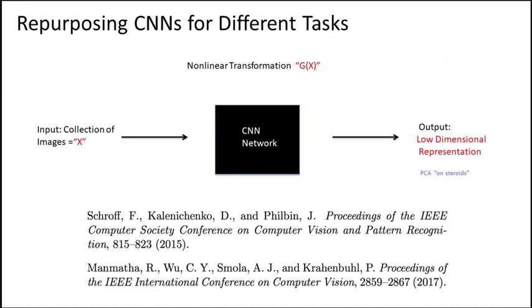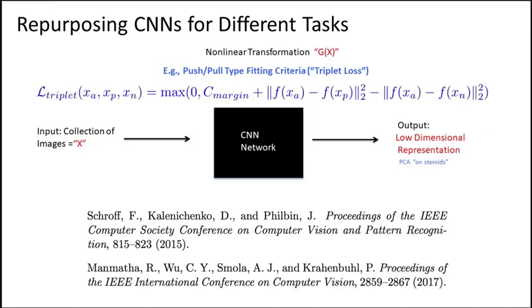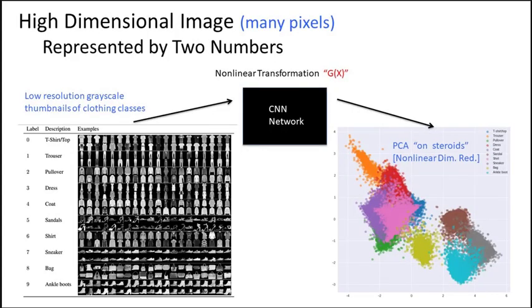Before, what we were showing were convolutional neural networks where you were basically extracting features and then putting them into a classifier. The same technology is being used here in order to do image compression. You could use the exact same ideas from the convolutional neural network, but your objective function just changes. So instead of trying to find a class probability, you take a large collection of pixels that are spatially correlated and have different channels and compress that down to a 2- or 3-dimensional number that is informative. And so that's what we're doing here.